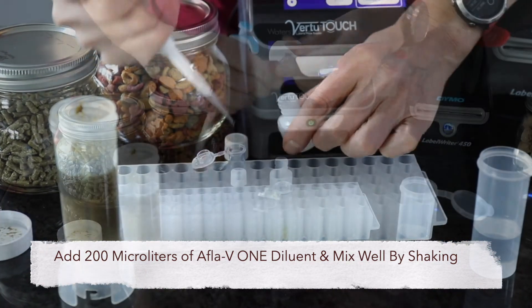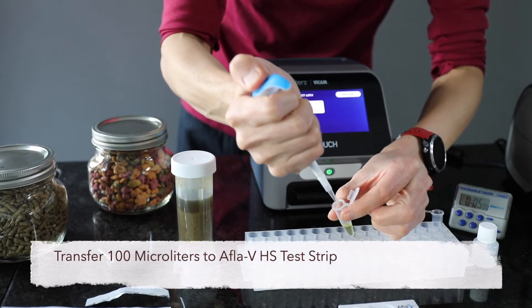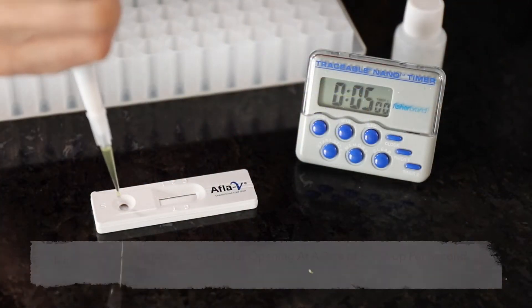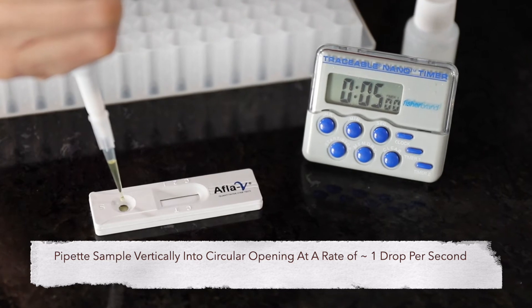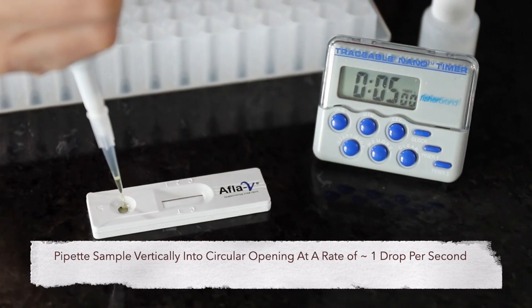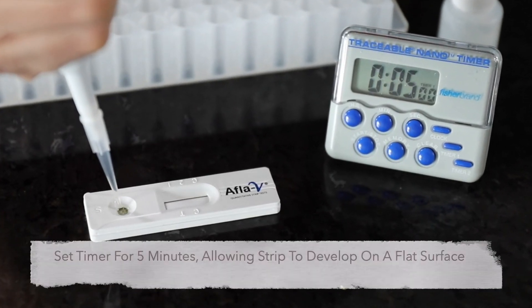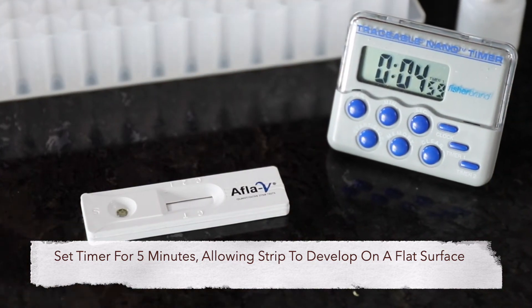Replace the vial cap and mix well by shaking. Transfer 100 microliters of this diluted sample to the Afla V1 strip by pipetting vertically into the round sample opening, allowing the sample to flow at a rate of about one drop per second. Set the timer for five minutes, allowing the strip to develop on a flat surface.